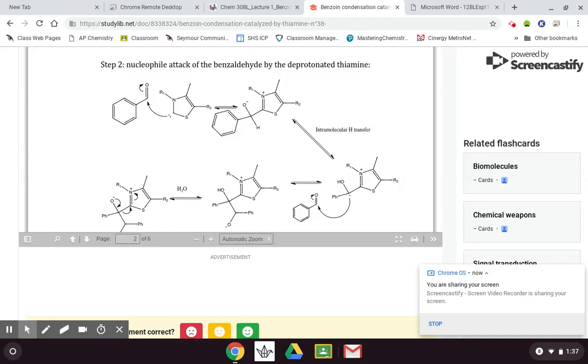And what I wanted to end the course with is what typically is true about manufacturing certain molecules is that it's not a one-step thing. And it turns out that in this lab, what we're going to do is 3 separate experiments.